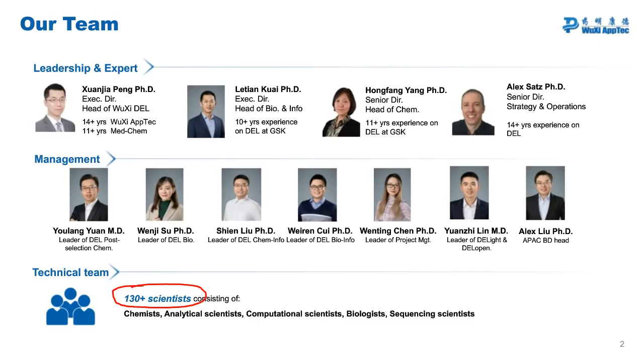Are there procedures to prepare positive and negative controls while using DELs? So we don't have those written out in detail. But certainly, if you needed help with that, that's something that WuXi will certainly help you do, yes.